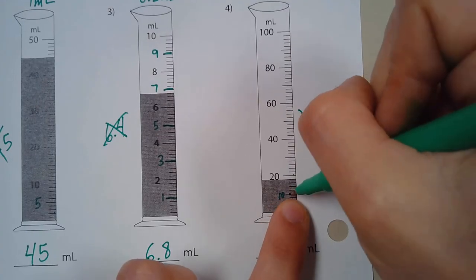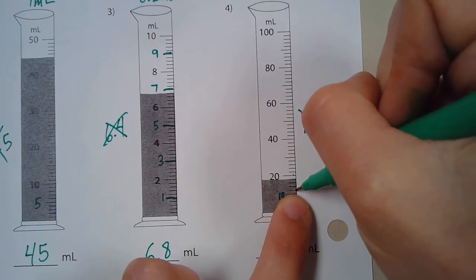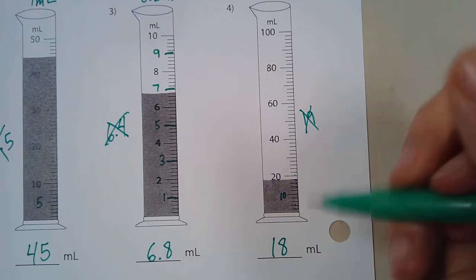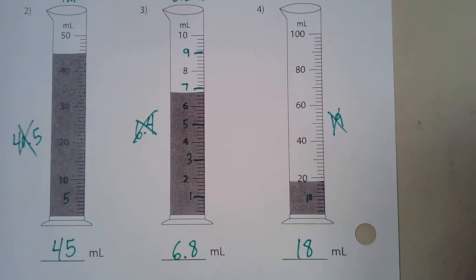So you can go up to the number 10, and the next line up would be 12, 14, 16, 18. This graduated cylinder holds 18 milliliters of liquid.